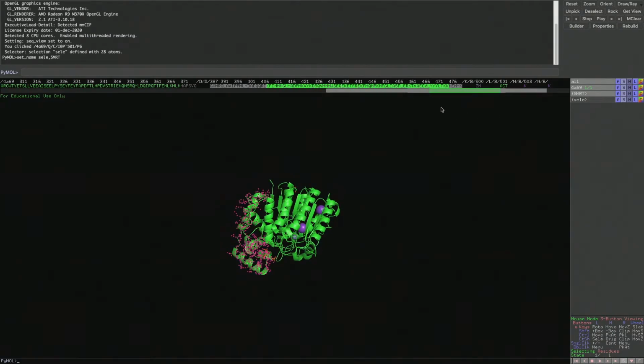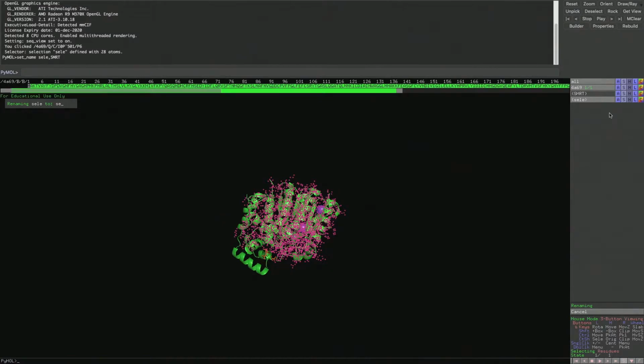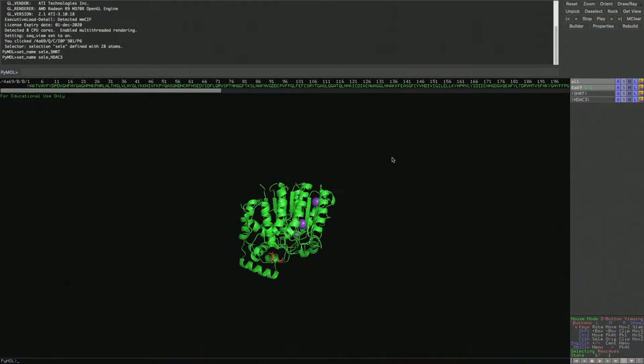I'm going to make this also a new selection. So now I have 2 selections: Smart, HDAC3.